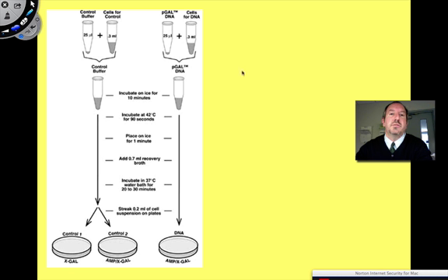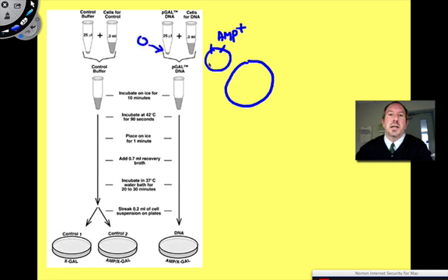And we believe what's happening is, inside here, the little plasmid that has ampicillin resistance, which is over here, this is the plasmid, has ampicillin resistance in the lactose operon. We believe that the cold, the hot, the cold allows it to go inside. And if it goes inside, now this bacteria, when it grows, and why is it going to suddenly grow?